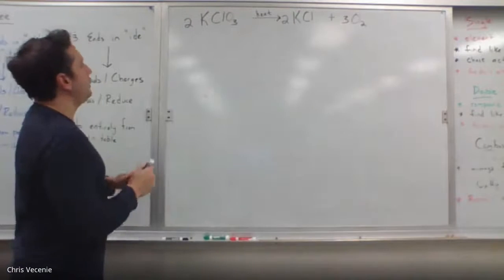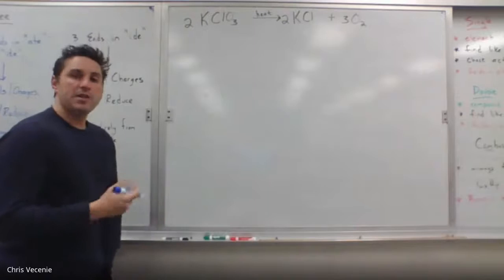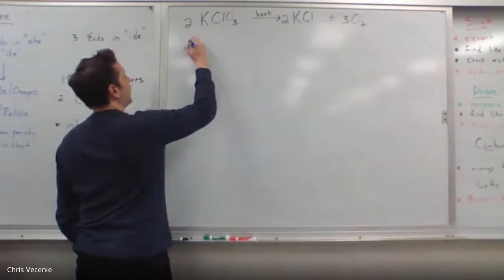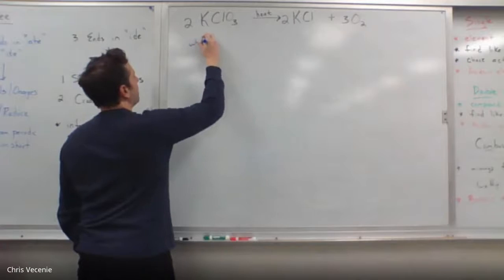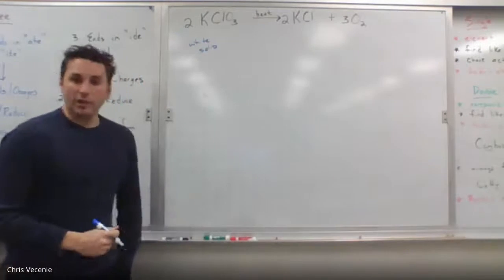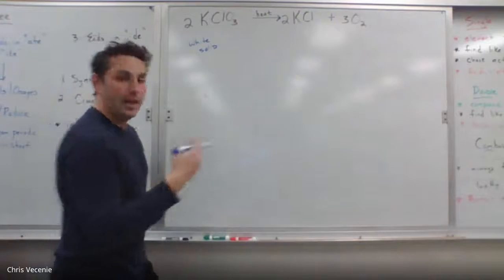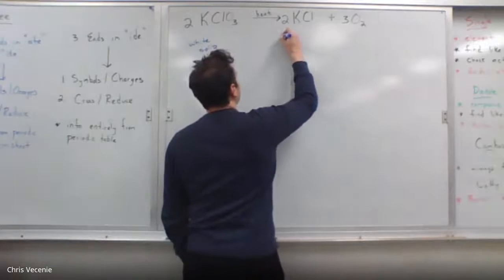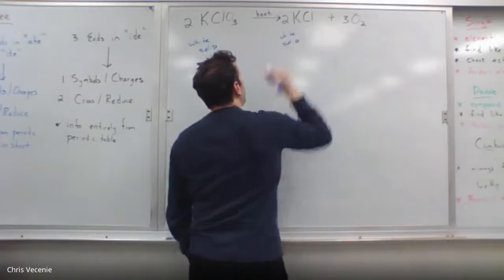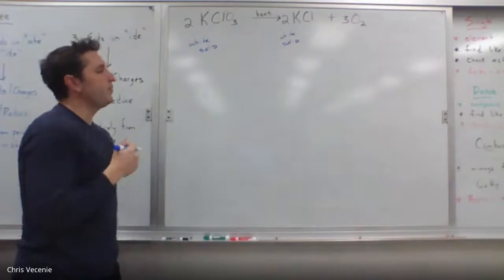Well, if you take a look at the equation, here's the pieces you don't know that you'll have experience with when we're done. KClO3 is a white solid. Because it's a solid, I can measure how heavy it is. I can measure its mass using the balance. KCl is a white solid. So I'm able to measure how heavy it is using the balance.